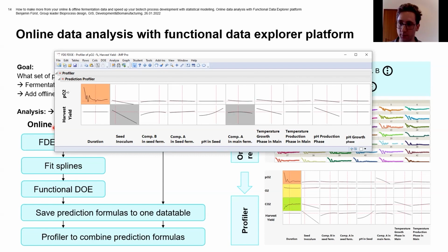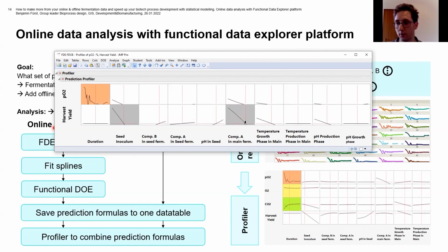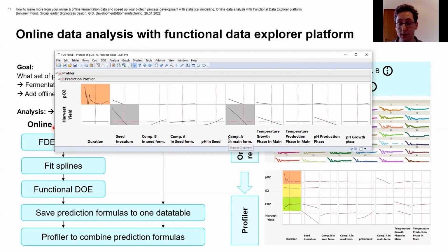You see here, that is the typical PO2 response to that set of parameters. And already going down here, you can see what happens. I'm going to go a little bit more down. The PO2 goes down. So in the fermenter, we don't have a limit now of component A, we have a limit of oxygen. That is just the reason why that is not good for the process.